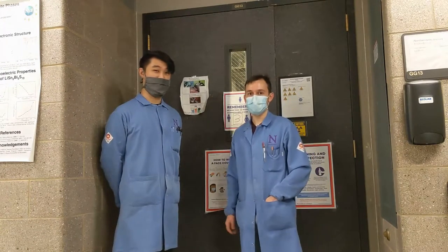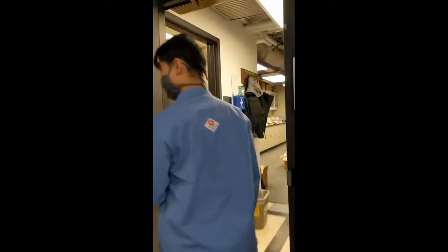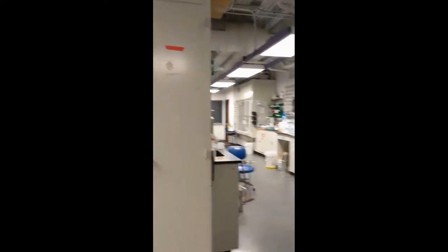Hey, I'm Eric. And I'm Ben. Welcome to the Kanatzidis Group. Today we're going to take you on a lab tour to show you what it's like to be a grad student in the Kanatzidis Group.